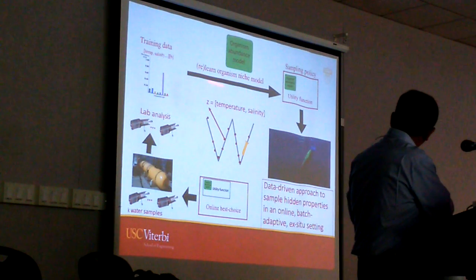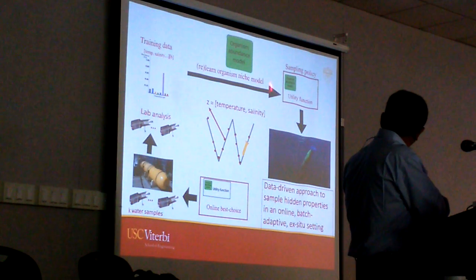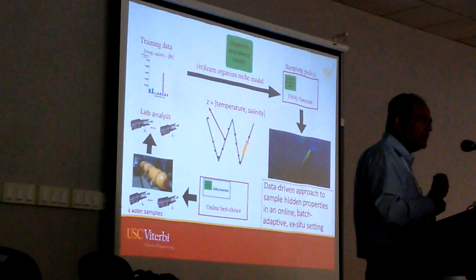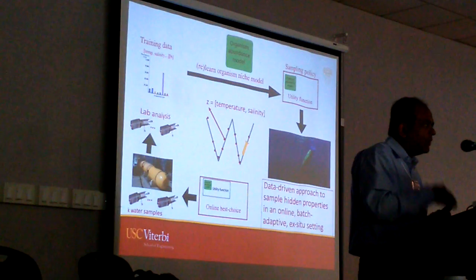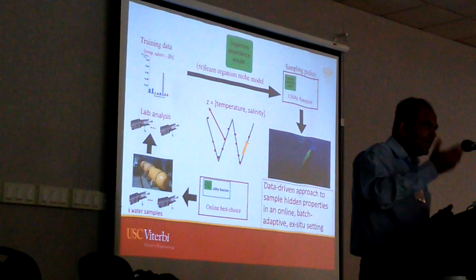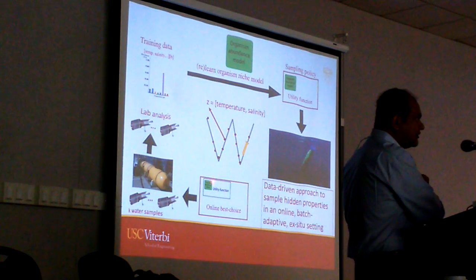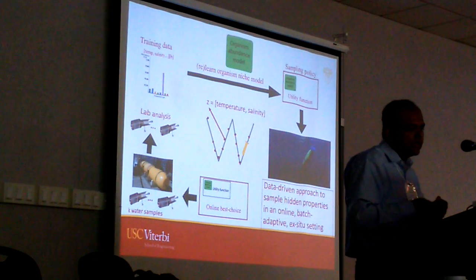We use that to build a forward model, and I'll tell you what the model looks like. It's not particularly fancy. But more interestingly, once you have that forward model, can you extract from it some sort of utility function to then trigger online the sampling decisions that you want to make, right? So I give you a model that predicts the biology. I want to put that through some kind of measurement of utility, and when those utilities spike, I want to trigger these sampling choices. That's kind of the loop. Then you trigger the sampling decisions, you bring water samples back to the lab, they're still analyzed offline, they get labeled, and then you can redo your model. And so that's essentially the workflow.